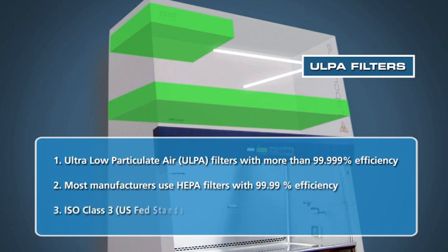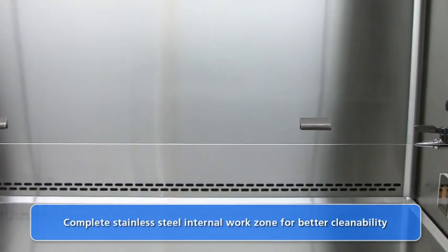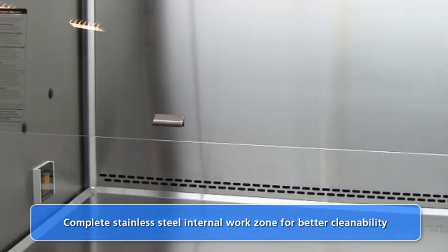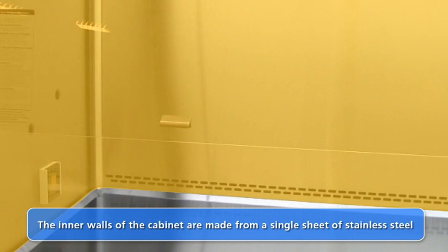As a result, LabCulture cabinets are able to provide a work zone cleanliness level of ISO Class III. Complete cleaning is simplified with the stainless steel internal work zone. The cabinet's internal side walls and back wall are made from a single sheet of stainless steel, a unique feature which eliminates any welded or sealed joints which may harbor contaminants.